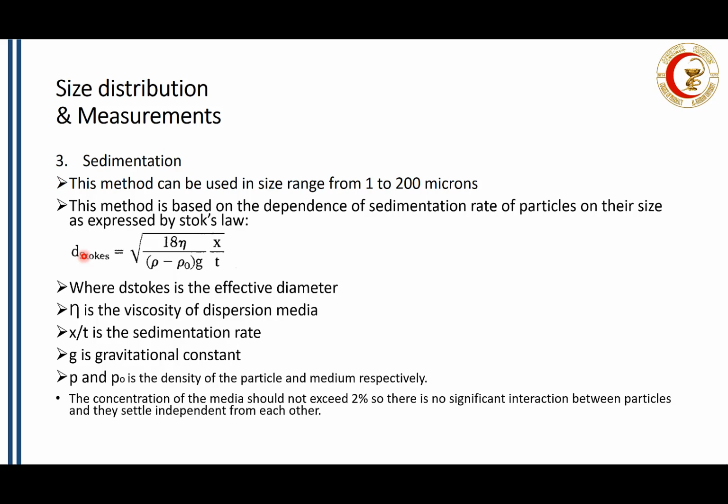We are not measuring the suspension. We need to eliminate other interfering factors such as the concentration, to ensure that the results we get from sedimentation measurement are applicable to the particle size of the final product of milling.